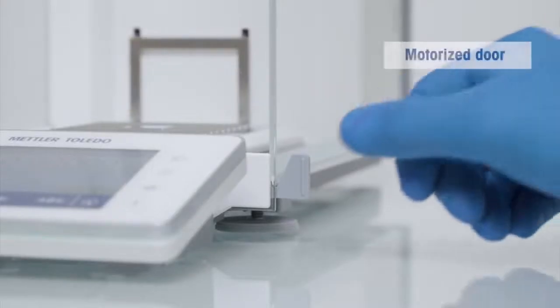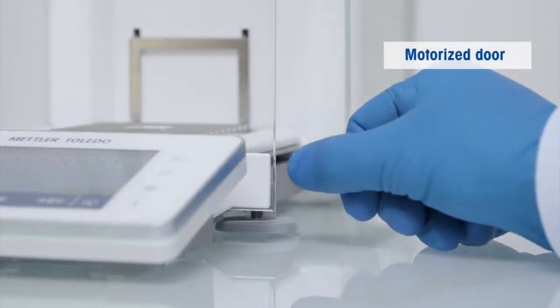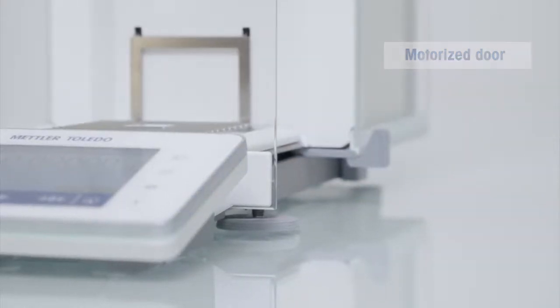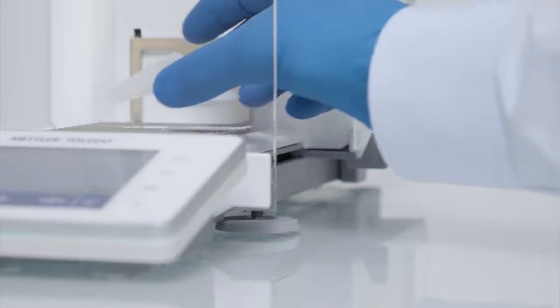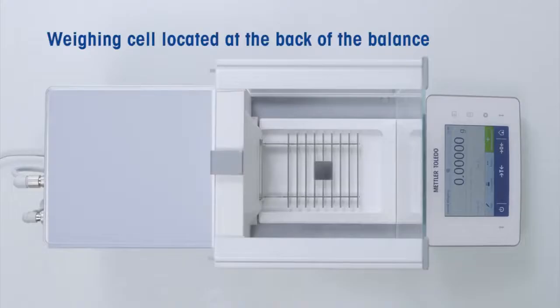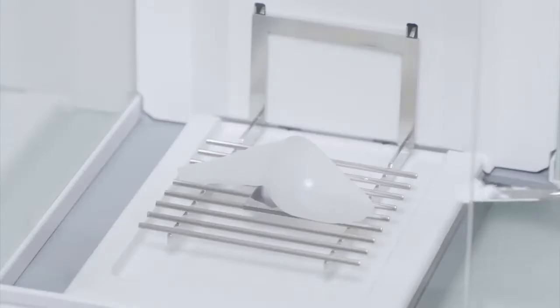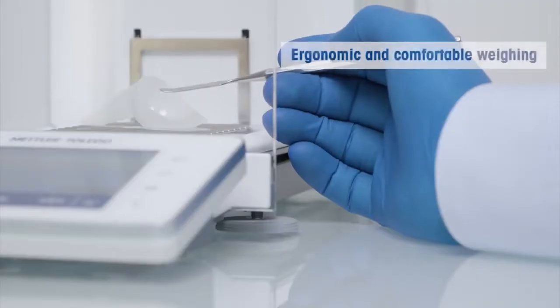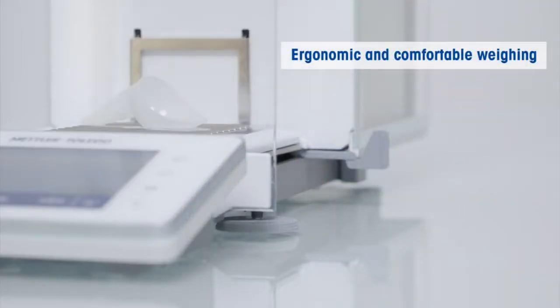The doors can be opened motorized by a gentle touch on the door handles and give good access to the weighing pan, which is positioned low and is separated from the weighing cell which is located in the back of the balance. Manual dosing operations on the weighing boats or weighing papers can be performed ergonomically just by laying the hand on the bench. This reduces the fatigue of your hands even for long working hours.